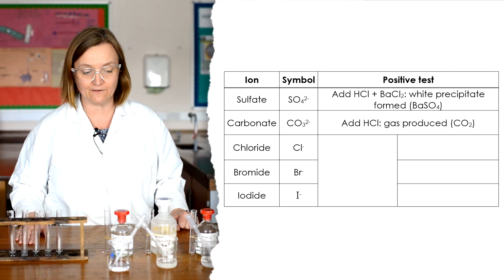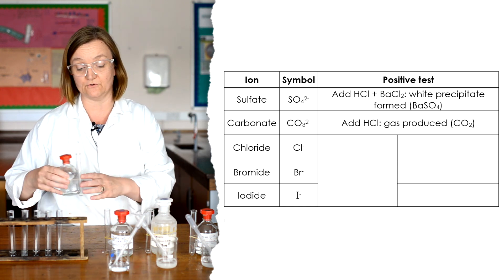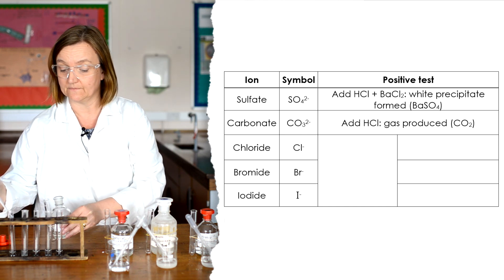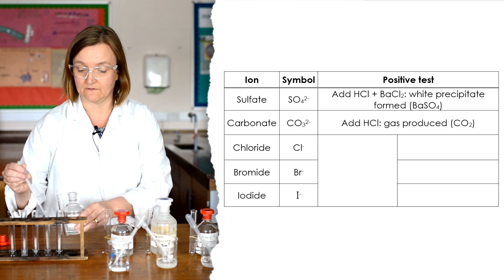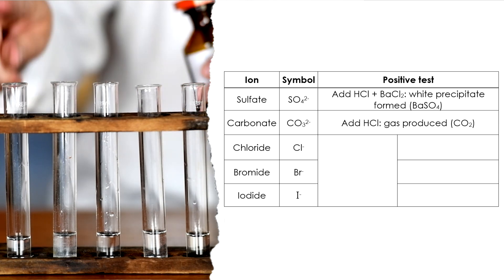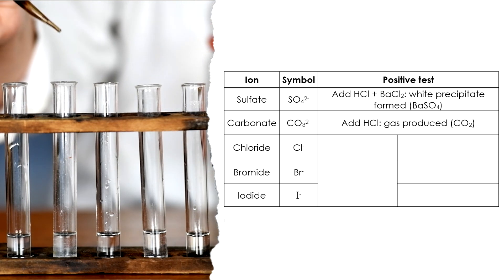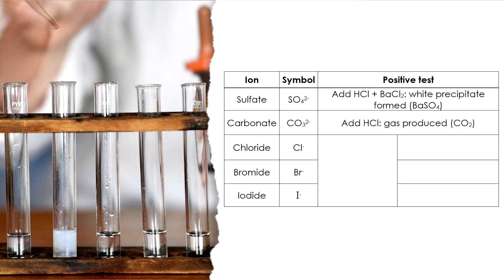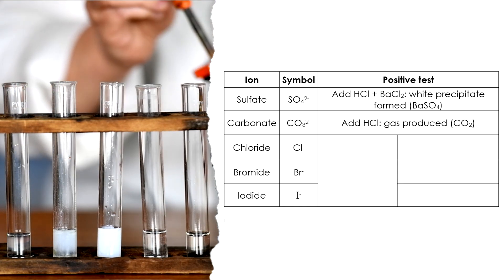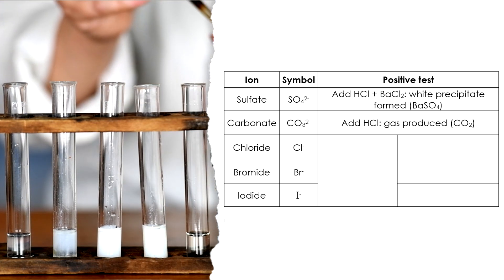So I've got five fresh samples now of my sodium salts. And the final test I'm going to do is, first of all, adding a few drops of nitric acid to each tube. And now I'm going to add some silver nitrate. We've already had one precipitate formed with the barium chloride and the sulfate. Will it do anything with silver nitrate? No. With the carbonate? A precipitate from the carbonate. The chloride? Another one. The bromide? Yet another one. And finally, the iodide.